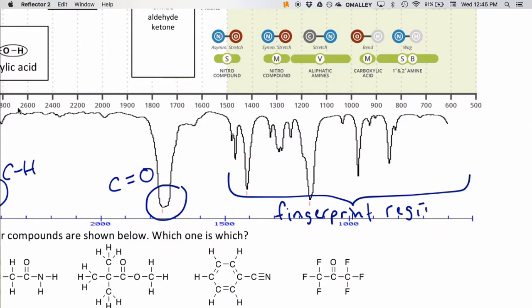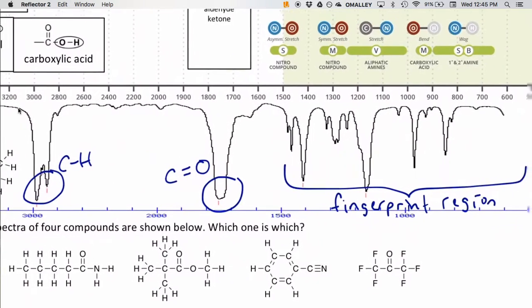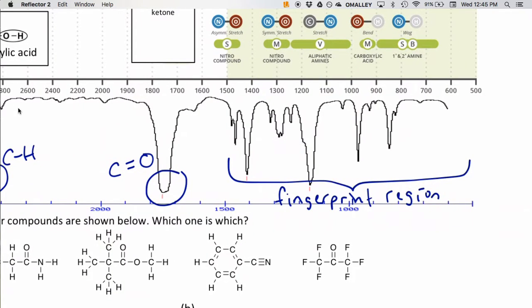And while it has many peaks in it, it's so unique for each molecule, it's not as descriptive for someone that's just starting to learn how IR spectroscopy works. So we're actually not even going to address the rest of these peaks. Clearly there are carbon-carbon single bonds in there, and then you might be saying, well, why are there so many others if there's only 3 different types of peaks?